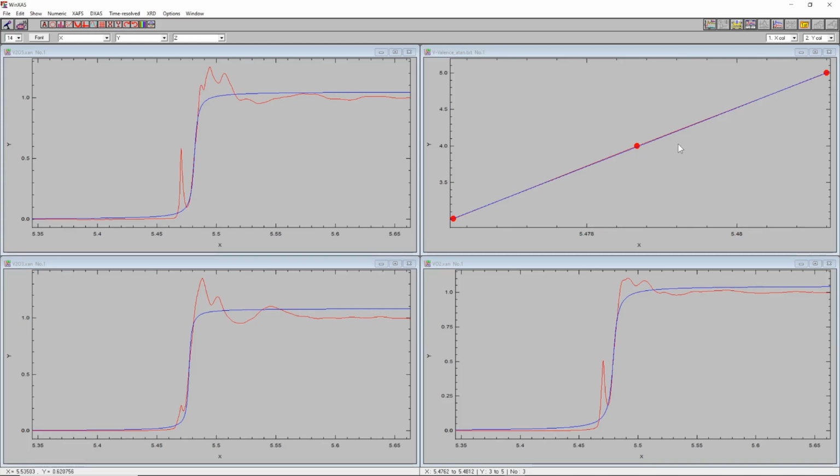we can use this calibration curve now to determine the evolution of the average valence, for instance, of vanadium samples under reaction conditions. So, but this is something I want to show, but in another tutorial, of course, when we are looking at a batch analysis of series of spectra collected under reaction conditions from in situ experiments.